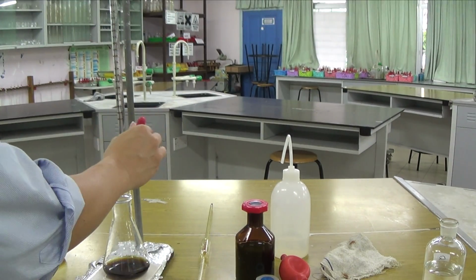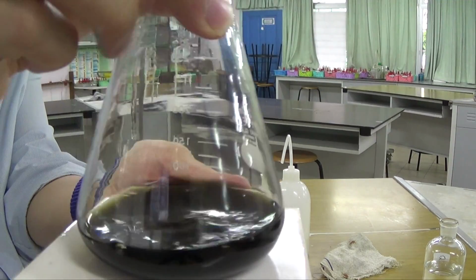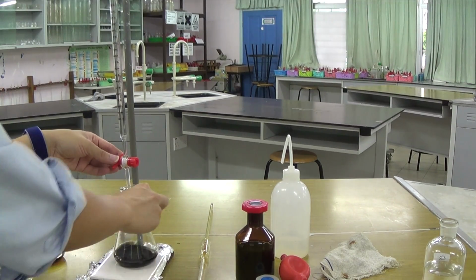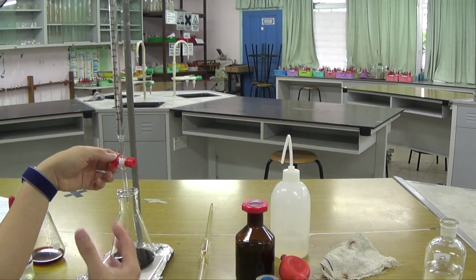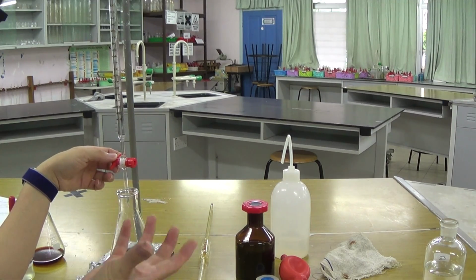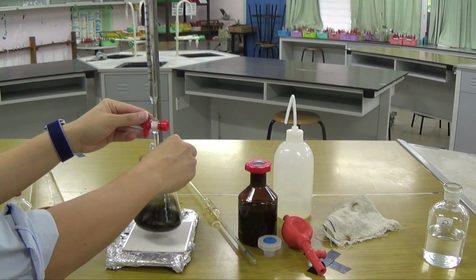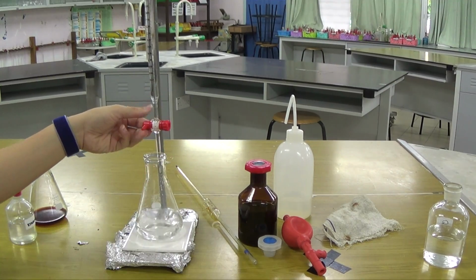If I add just a bit more starch, as you know, the indicator does not get involved in the reaction. It simply gives you a color change here. So even though this is already brown, it gets a bit difficult to tell the end point without the use of the starch indicator. So we should expect it to go colorless, because when all the iodine is gone, starch with no iodine would just be colorless. Alright, so let's see what happened here. So my hand on the tap, I don't care where I stop. I open it full speed, and then when it turns colorless, then I stop.